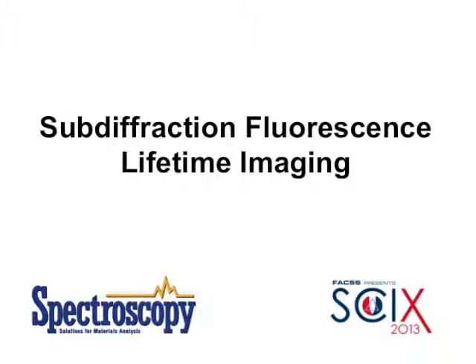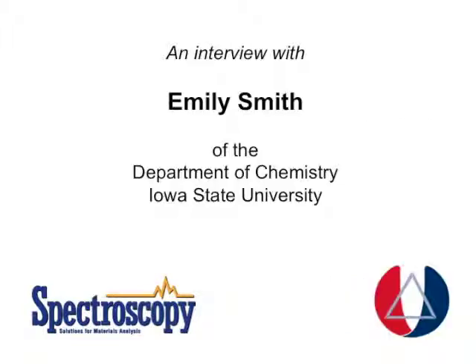Your presentation discussed a technique called stimulated emission depletion fluorescence microscopy, which you use to collect subdiffraction fluorescence lifetime images. Can you briefly describe the technique?